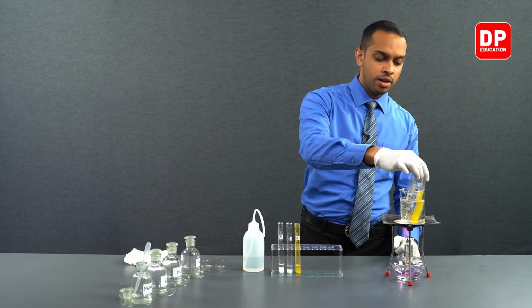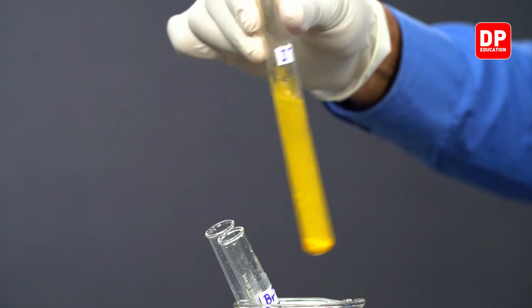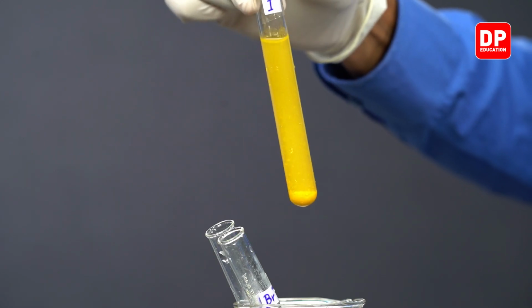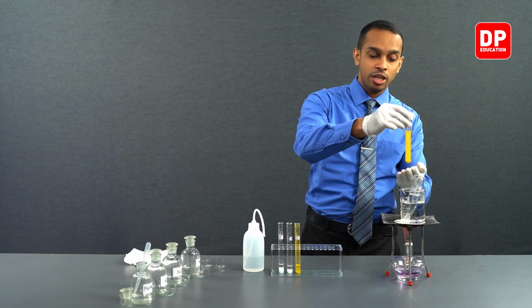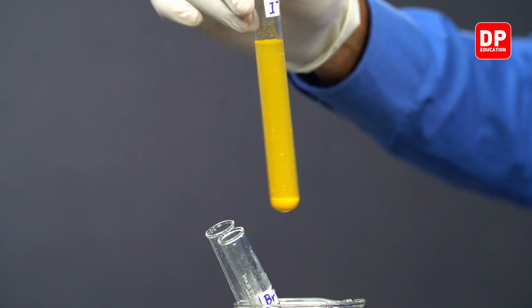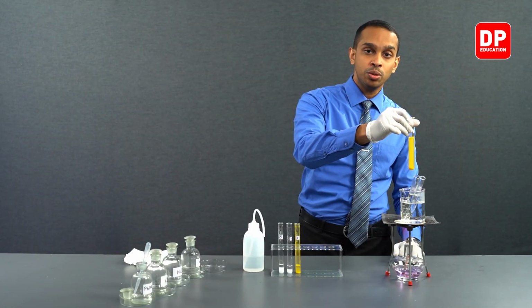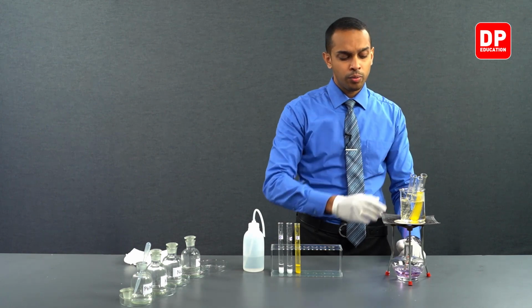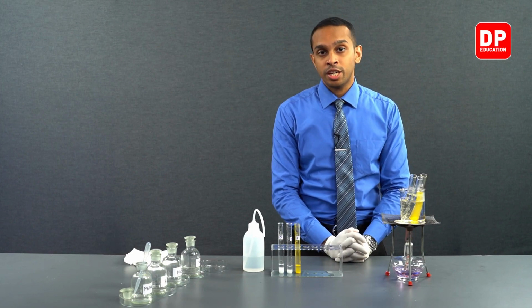And if you observe our lead iodide solid, the solution has now started to lose some of its color. That is due to most of the precipitate starting to dissolve. Now this color change is still not very clear, but if you leave it there for a little while longer, you will observe that all of the precipitate completely dissolves as you heat it up. So we'll give it a little bit more time, and once it's completely dissolved, we'll come back and observe the changes.